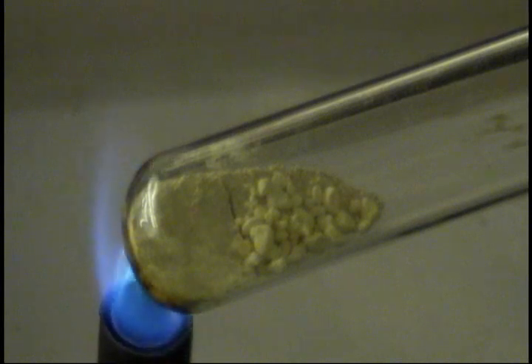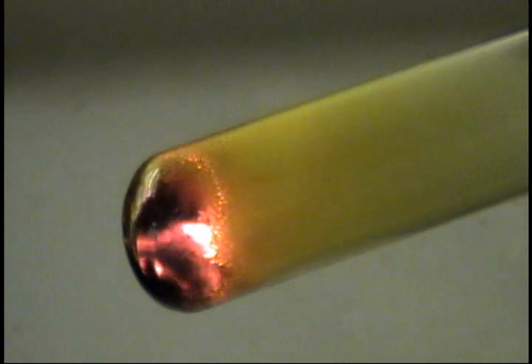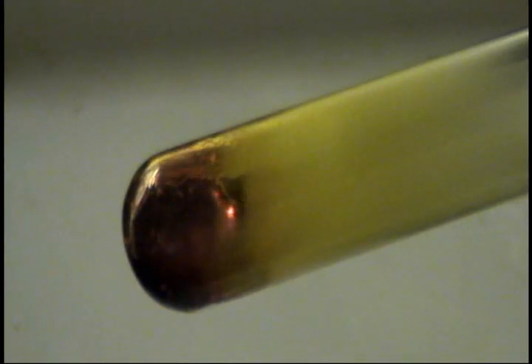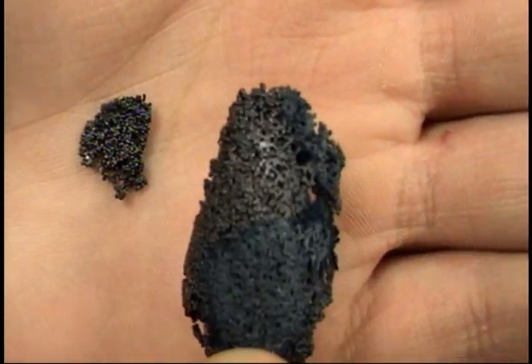Again, as soon as it ignites, move the fire. There you go. And that was sulfur and copper — and this is copper sulfide, which is the product of the reaction. It's a bluish color, and its properties are completely different from those of sulfur and copper.